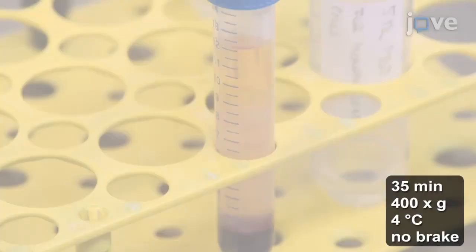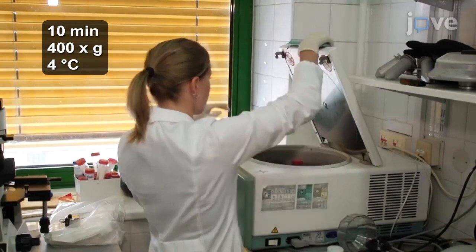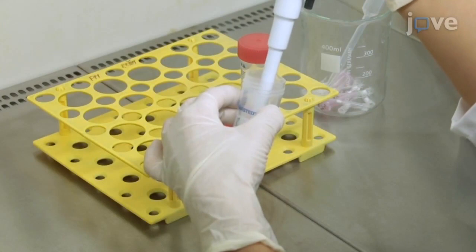Use a Pasteur pipette to carefully transfer the interphase layer of mononuclear cells to a new 50 mL conical tube containing 5 mL of PBS for a centrifugation wash. Then re-suspend the mononuclear cell pellet in 2 mL of sterile PBS for counting, and dilute the cells to a 3 times 10 to the 7th cells per mL concentration.